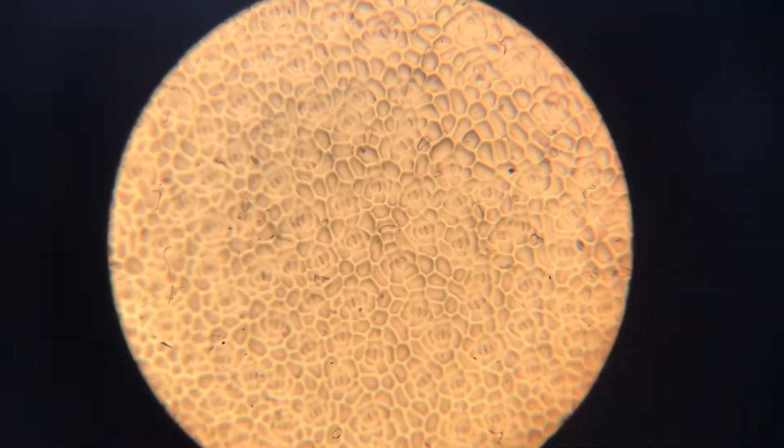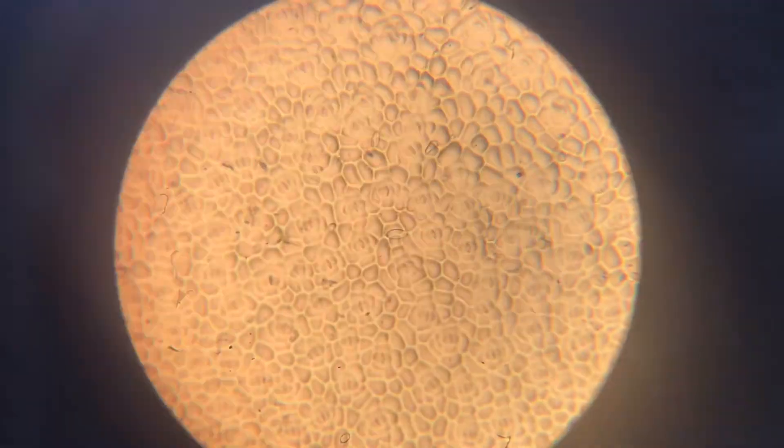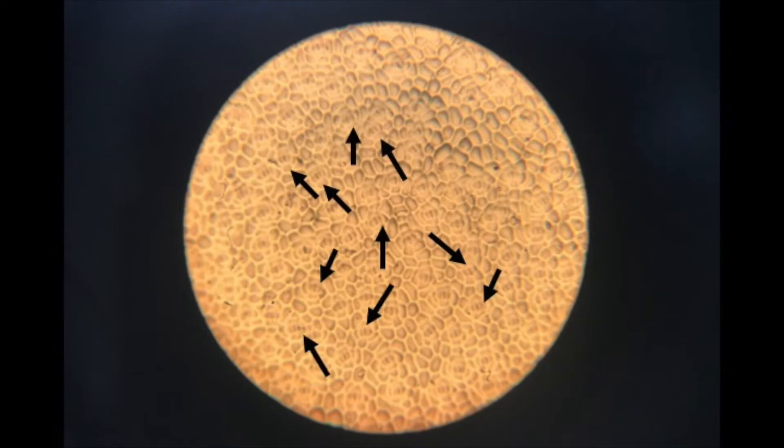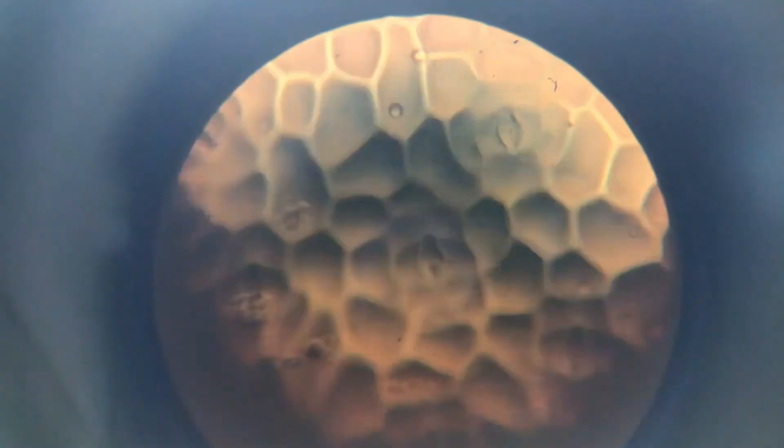At lower resolution, stomata look a little bit like diamonds. At the highest magnification you can actually see what they are in detail. Each stomata is made up of two guard cells either side, and the gap in the middle is the opening.